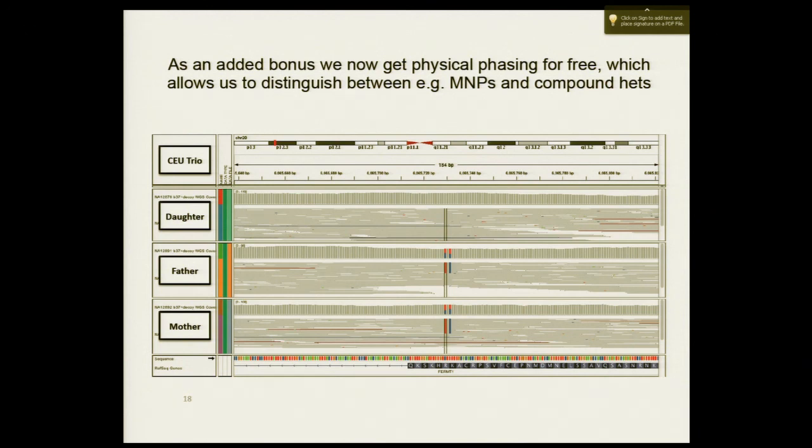People get nervous when there are these strange records. Each one of the genotypes is going to be reported in a separate line? No, it's going to be the same. It'd be 1 record. So this sample would be 0/1, where 0 means blue, red, red, and 1 means red, red, blue.